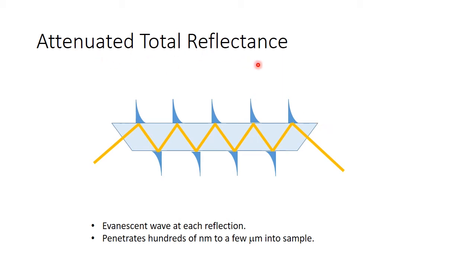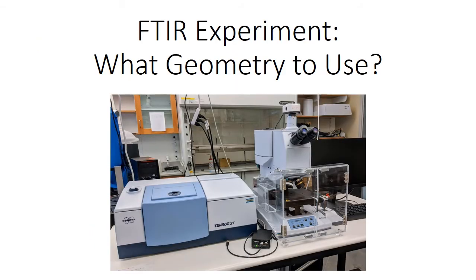I wanted you to see this. This particular geometry is a multi-bounce geometry. There are also ATR attachments that are just single bounce, that probe your sample in a single location, and we have both.